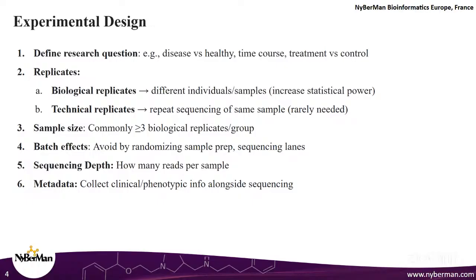And then when I have to run the next batch, I will take the remaining 3 of my control samples and 2 of my disease samples, right? So this randomizes the thing. Now my batch effects are not confounding with my condition. So now I can use certain statistical techniques, or certain error reduction techniques, to remove these batch effects and focus on only the biological difference.